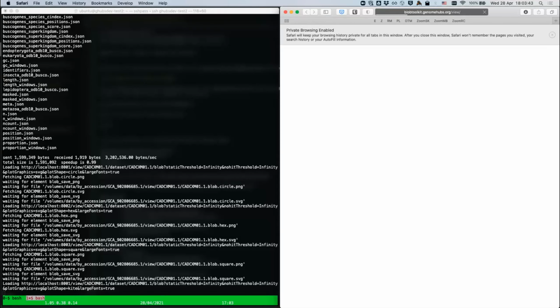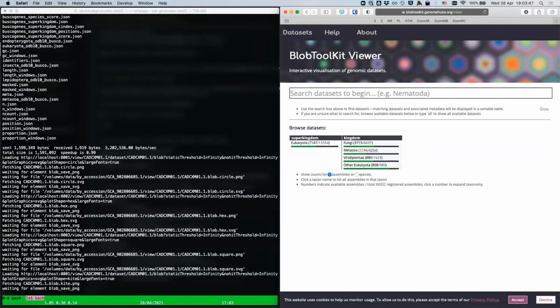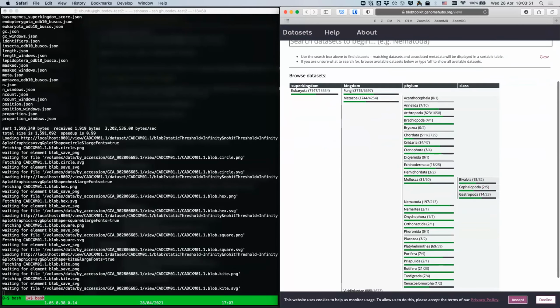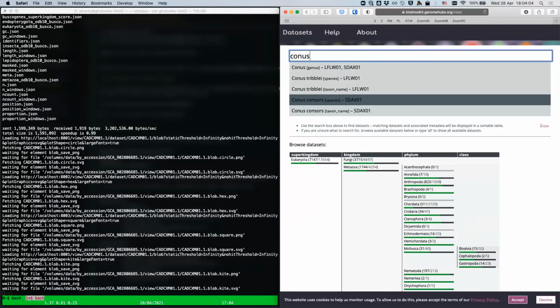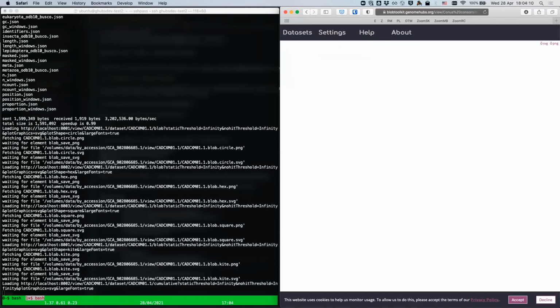Yeah. Okay. So if I go to Metazoa and I go to Mollusca and I pick up, what was the bad assembly we had last time? I've forgotten. Conus. Say that again. I think it was Conus. Maybe I can't remember. Conus consors. Yep, that's the one. Oh God, but that was also the one that takes a very long time to load. Oh yeah, it's in several million pieces.